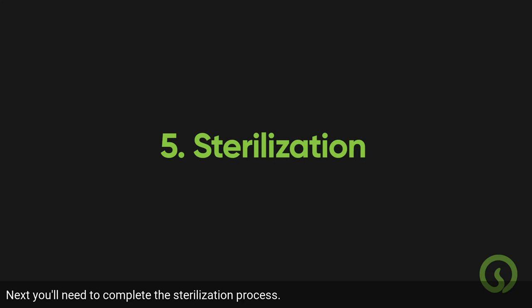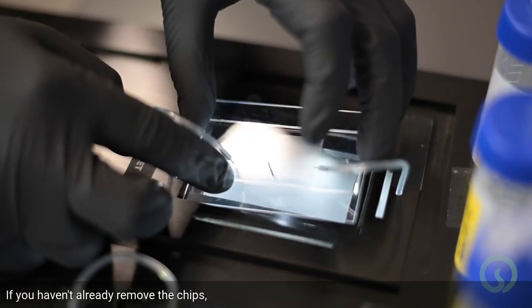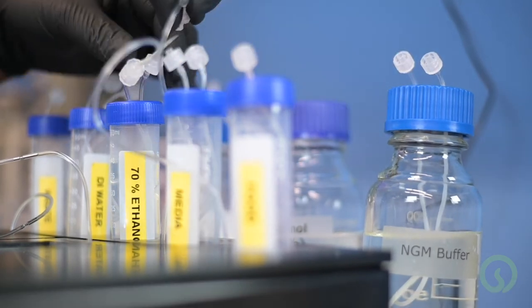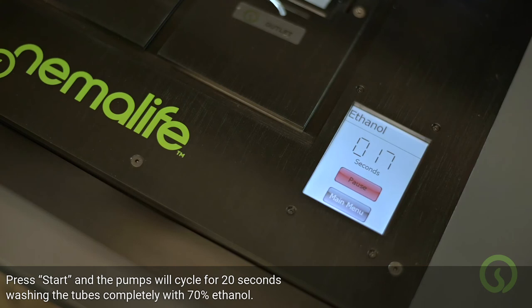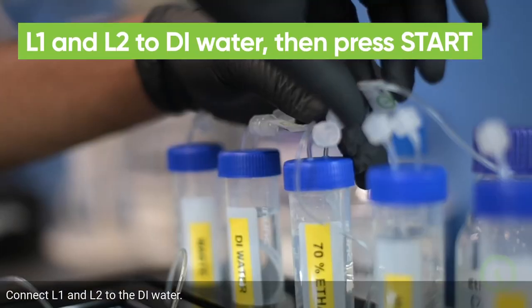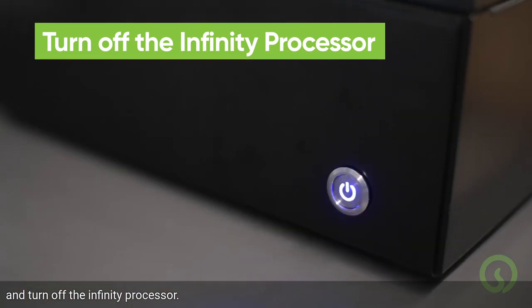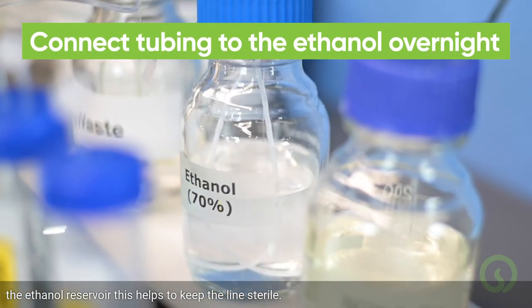Next, you'll need to complete the sterilization process. Go back to the main menu and choose Sterilization. If you haven't already, remove the chips and reconnect the inlet and outlet tubes. Then connect L1 and L2 to the ethanol reservoir. Press Start and the pumps will cycle for 20 seconds, washing the tubes completely with 70% ethanol. Step 2 of 2 is to rinse out the ethanol with DI water — connect L1 and L2 to the DI water and press Start. Once complete, turn off the Infinity processor. Don't leave the tubing in the media bottle overnight; instead, put the tubing in the ethanol reservoir to keep the lines sterile.